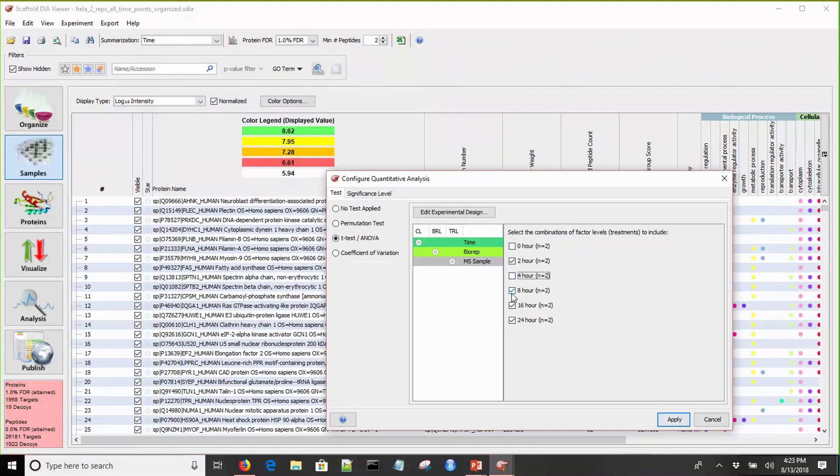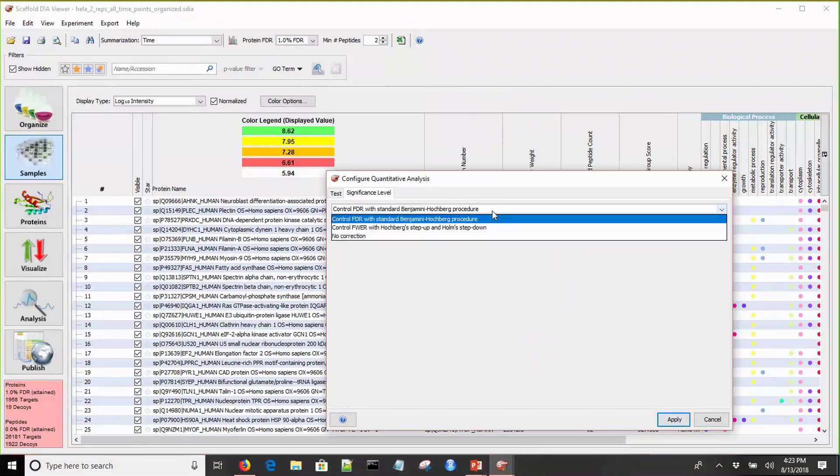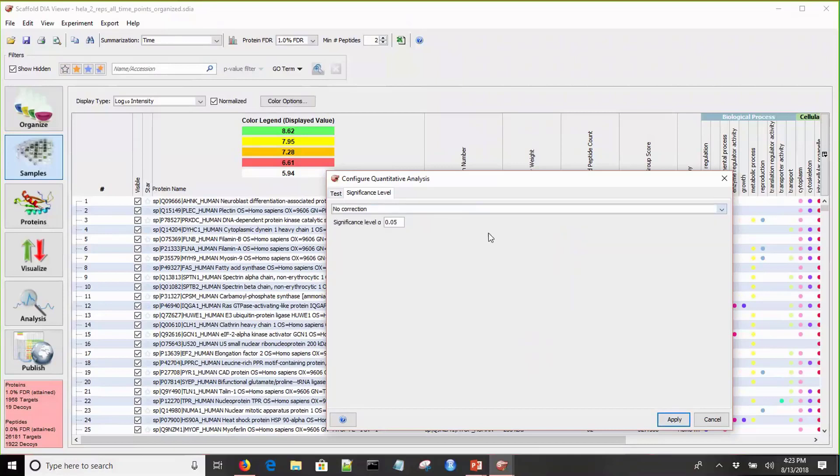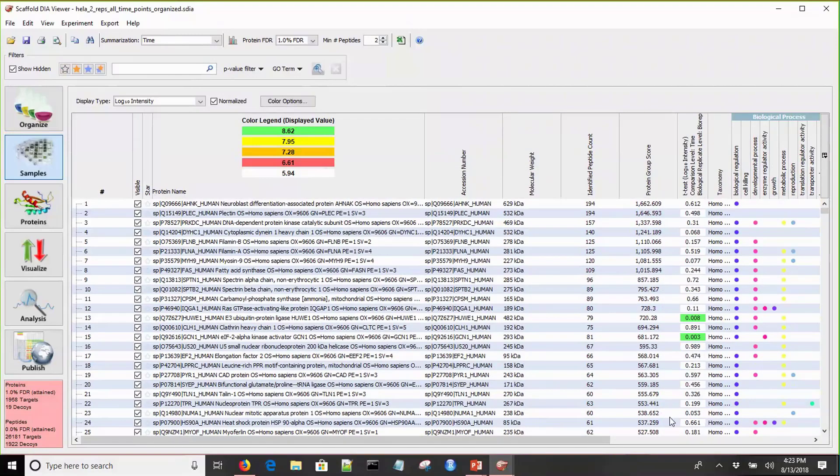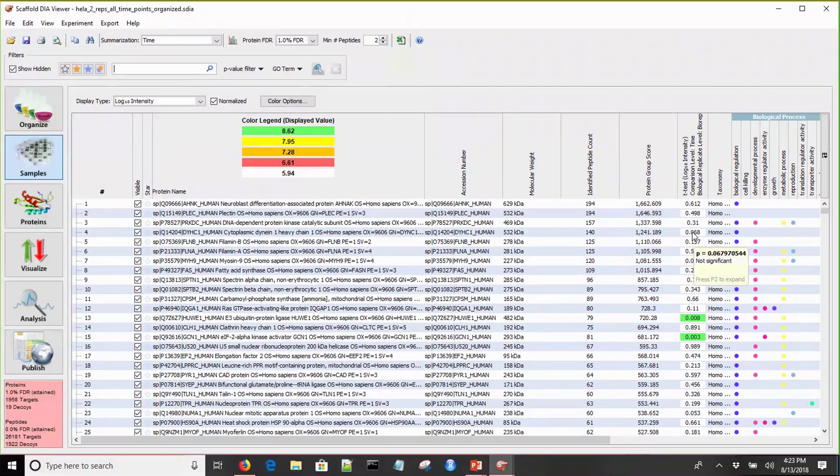What I want to do is remove a couple of the factors from the experiment. These are not the ones that we're interested in. This will allow us to look at a t-test comparing the 2-hour to the 16-hour significance level. By default, Scaffold adds the Benjamini-Hochberg procedure for multi-test correction. Because we don't have the full statistical power of the experiment, I'm going to disable that for now, but we'll leave the significance level at 0.05. We'll go ahead and apply that, and now you can see the t-test values are added for that comparison.